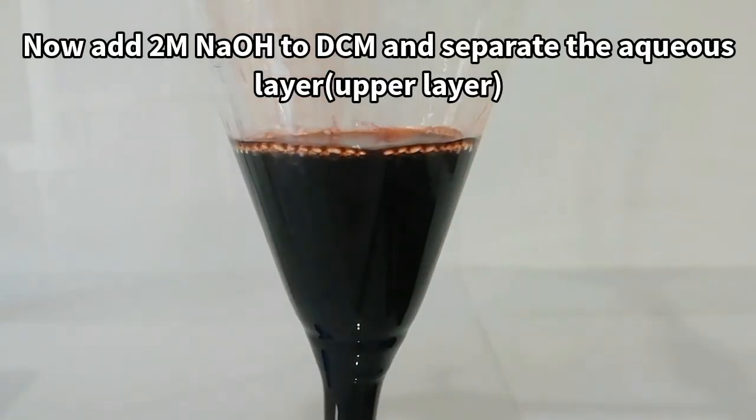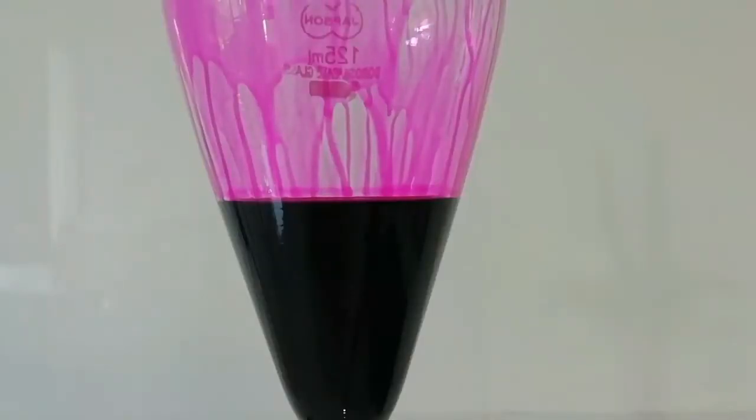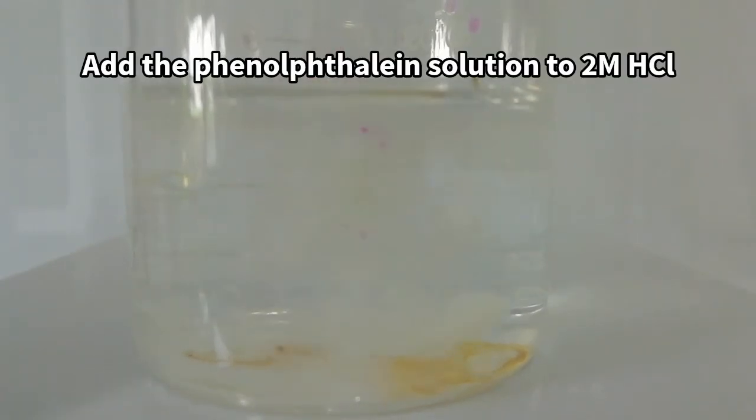To get our product, the solution was reacted with 2M sodium hydroxide. That makes the phenolphthalein water soluble. Then I collected the aqueous layer and it was added to a 2M hydrochloric acid solution.